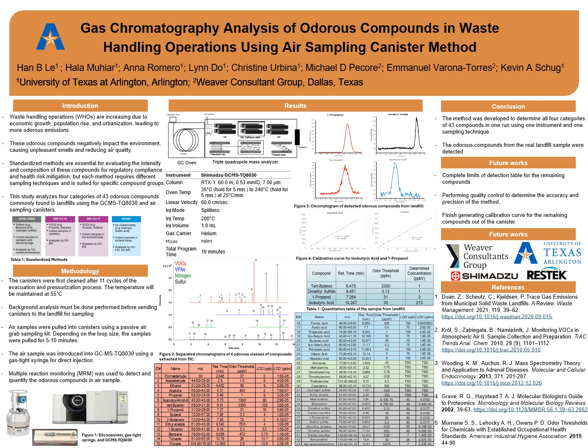This is what I'm doing so far, and in the future I will complete the limit of detection table for the remaining compounds and perform quality control to determine the accuracy and precision of the method, and also finish generating the calibration curve for the remaining compounds out of the canister.